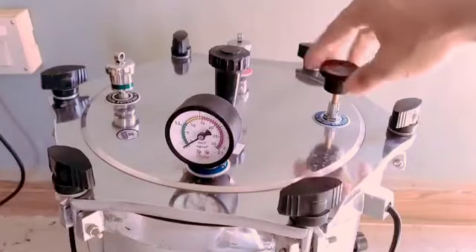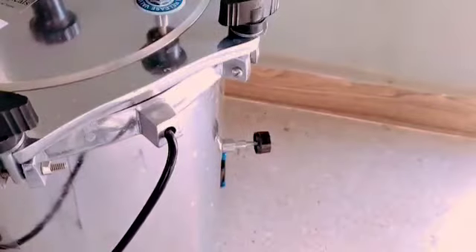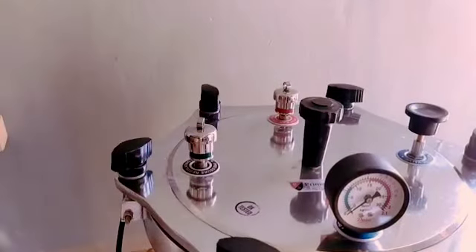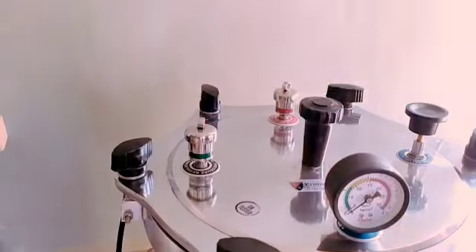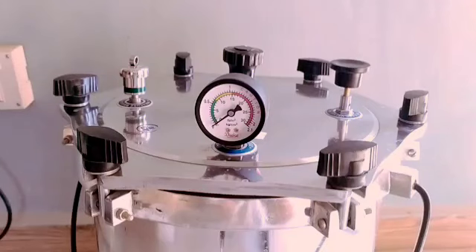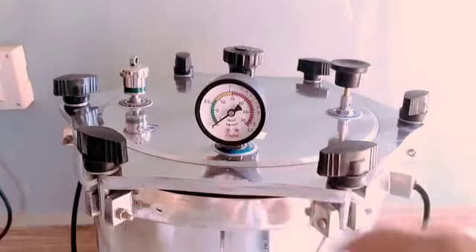Also make sure that the steam release and vacuum release valves are screwed tight. Also jiggle the two safety valves a bit to make sure they aren't stuck and can move freely. Also see that the pressure gauge reading is at 0. With all final checks made, the autoclave is now ready for operation.